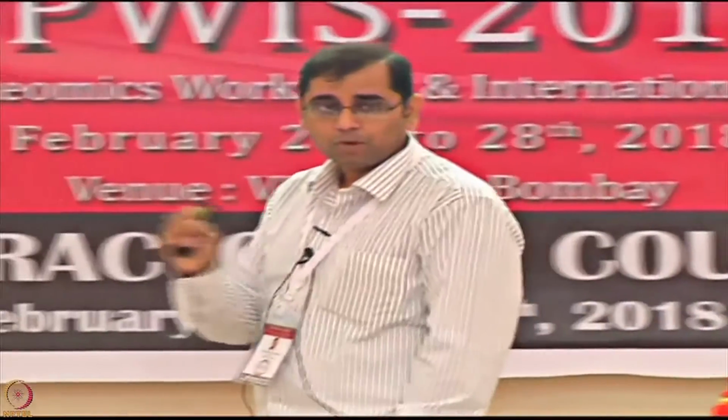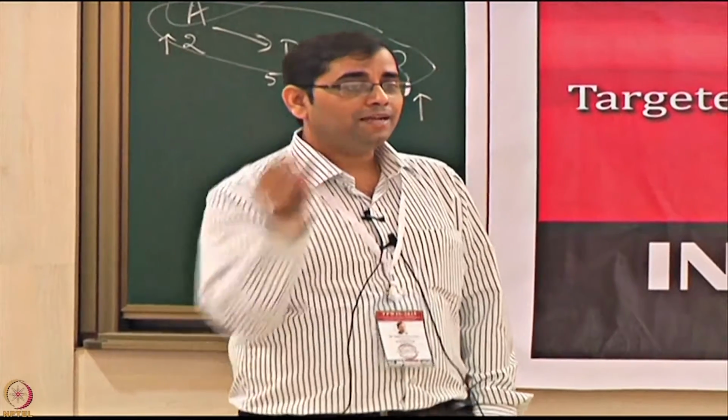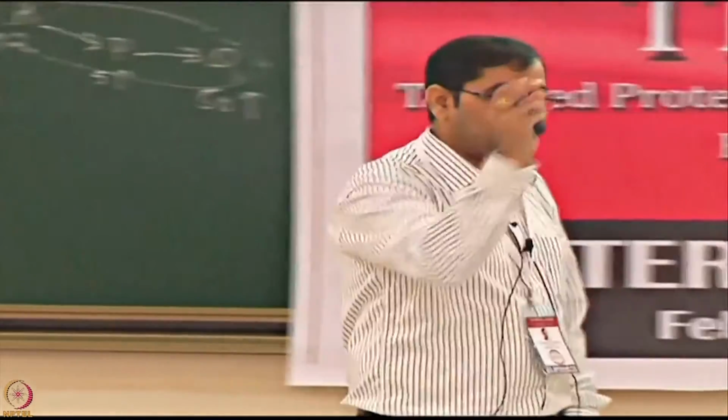You want immediate effects for any accidental condition, any kind of headache kind of thing. You want just a very quick response. So your on rate, you are looking at that time versus your off rate, becomes very different, right? So you want immediate action to happen. Something has to bind very quickly.